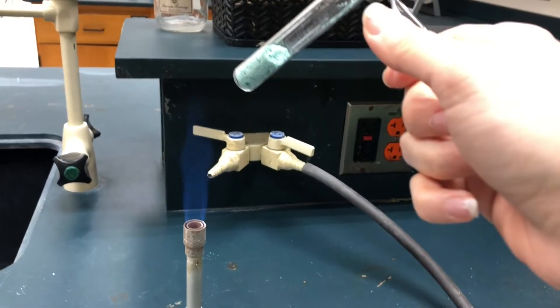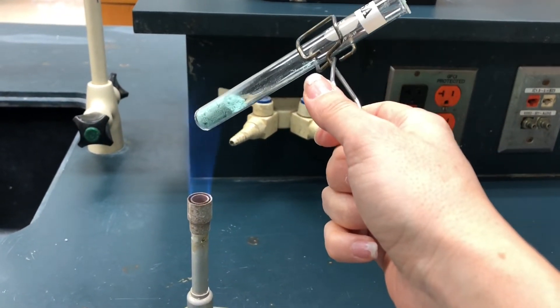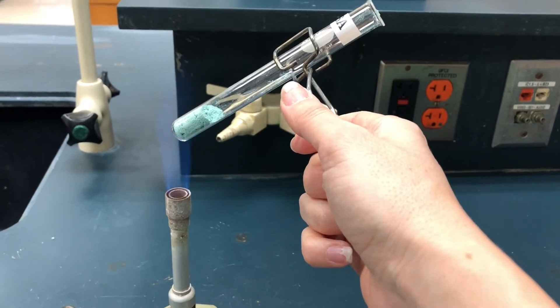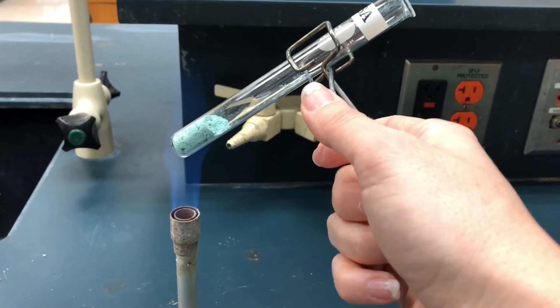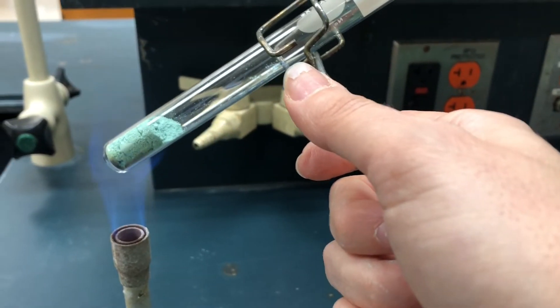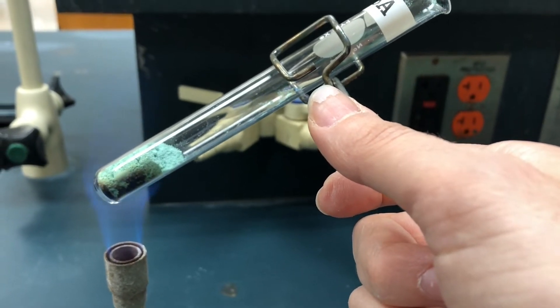Here's my Bunsen burner and I'm going to heat it up in the hottest part of the flame, which is this inner center cone. Notice I'm going to point it away from anybody who is near me and heat it up and make some observations. You can already see there at the bottom we're starting to see some change.